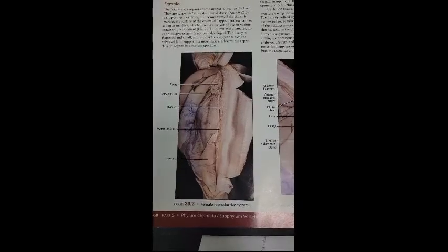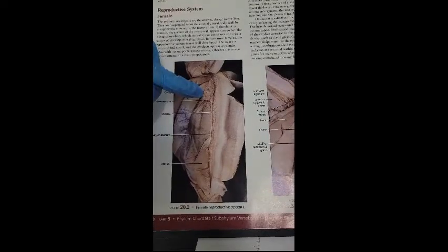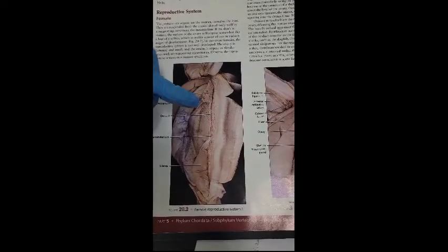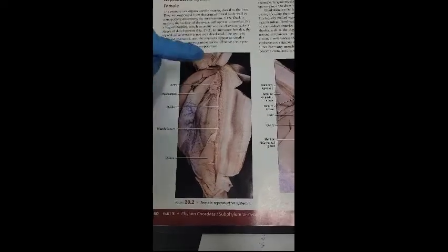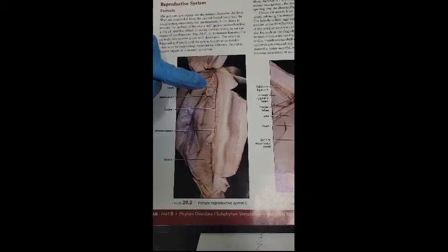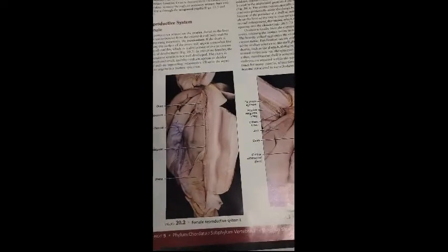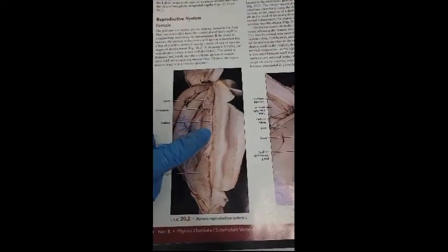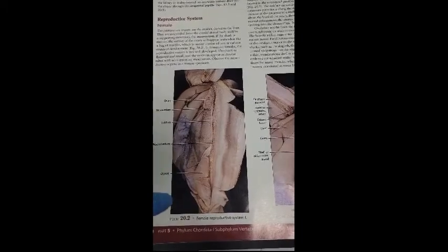So now we will talk about the female shark reproduction, in which the ovary is suspended by the mesovarium. Ovulation results from the rupture in the wall of the ovary, and the rupture releases a mature ovum through the ostium tube into the oviduct. And this oviduct is where fertilization occurs before it moves to the uterus.